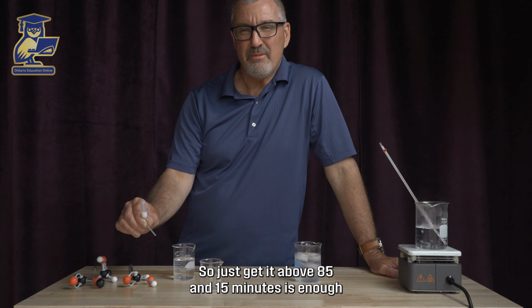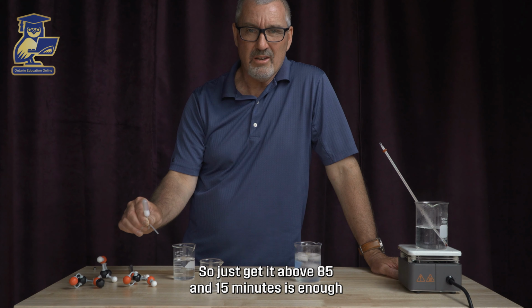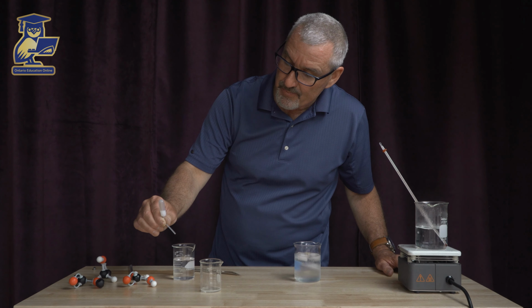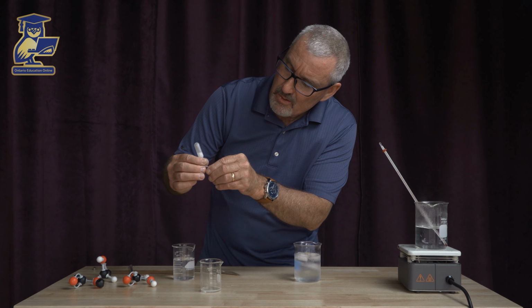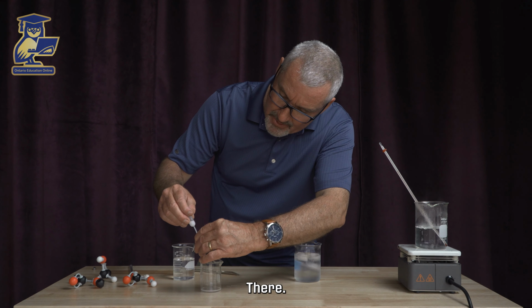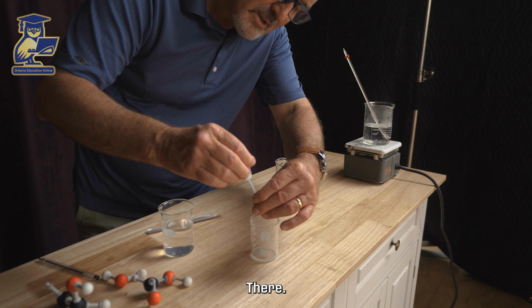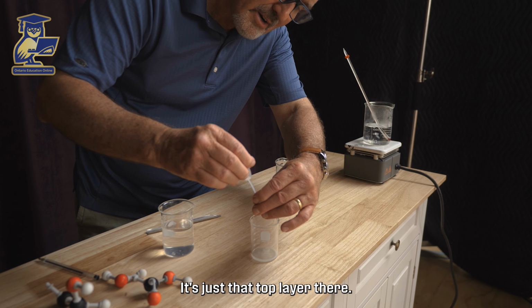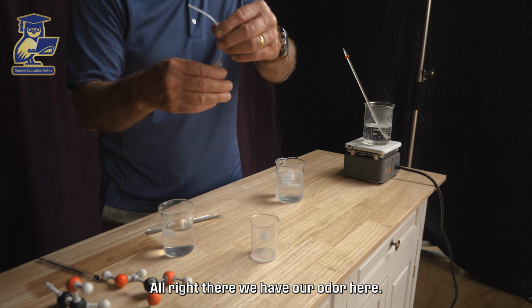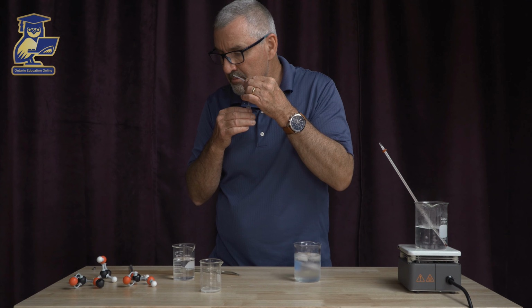Yeah, so just getting it above 85 for 15 minutes is enough to make enough ester to make a difference here. Yes, that's pretty rich on the top there. Just that top layer there. All right, there we have our odor here.